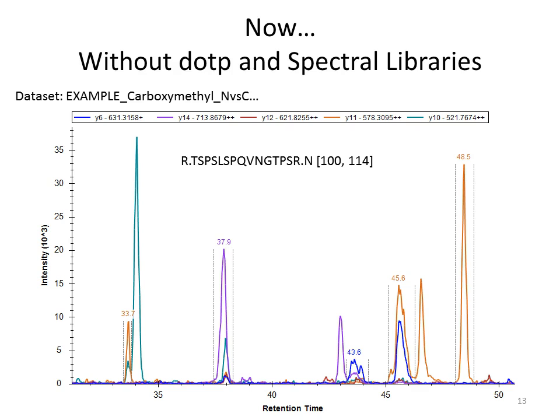So here's an example where this peptide doesn't have a library associated with it, so we don't get dot product. And there are a lot of nice peaks here, but thinking about something I said earlier, and I may have mentioned more than once, which peak do you think it is? Who said it? Yeah. Why? You see how that kind of jumps out at you? So this is one of those things where it took me a while to sort of make that work. Now every time I see it, my heart feels happy.